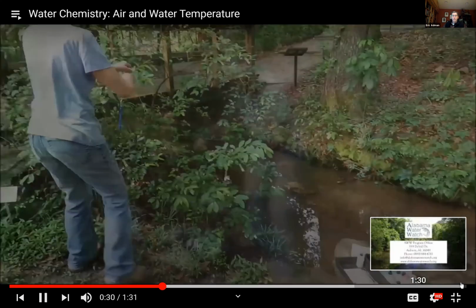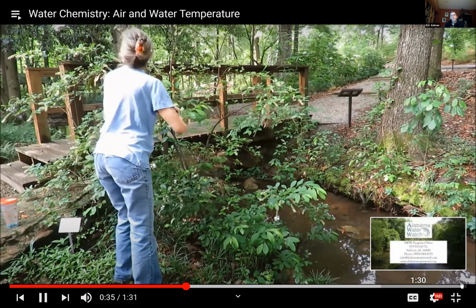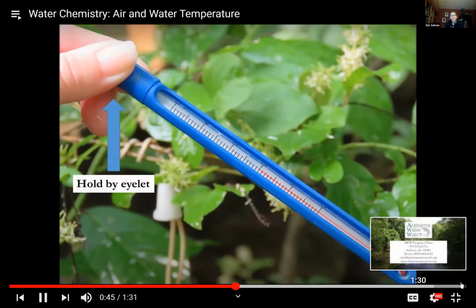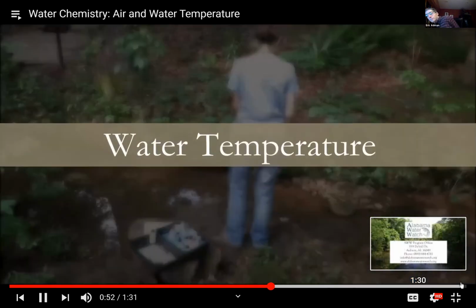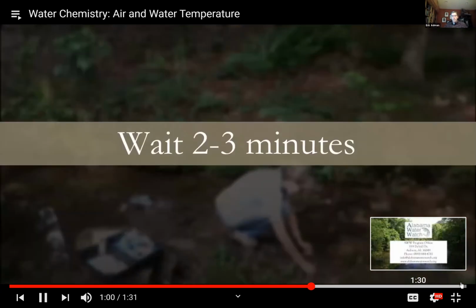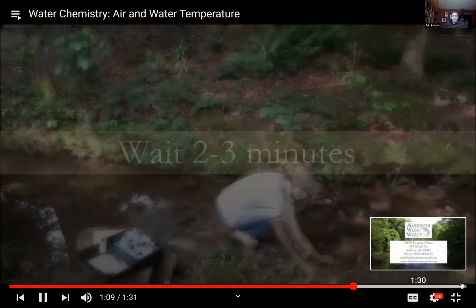Upon arrival at the site, place the dry thermometer in the shade until the temperature stabilizes. This will usually take 2 to 3 minutes. Once the temperature stabilizes, hold the thermometer by the eyelet to avoid touching the bulb. Read and record the temperature to the nearest ½ degree Celsius on your data form. For water temperature, submerge the thermometer in the water until the temperature stabilizes, or about 2 to 3 minutes. It may be necessary to anchor the thermometer to prevent loss in strong currents, cloudy water, or deep water.